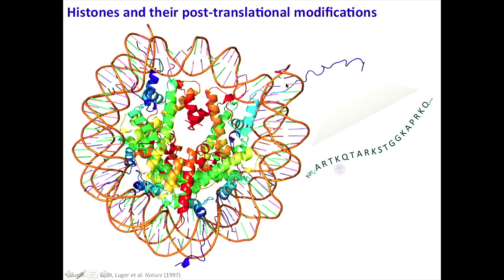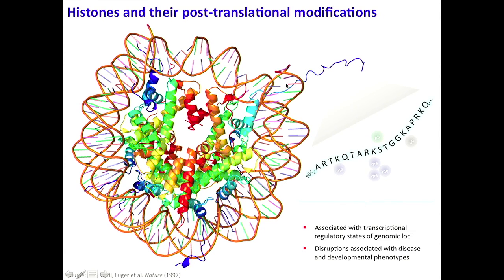And so yesterday we talked about what this assay is reading out and the sort of biology that it's reading out. It turns out that we know that there are associations with epigenetic processes and disease, but there are associations with all kinds of environmental conditions in epigenetics. It's potentially a metabolic sensor. Epigenetics have been proposed to be a readout of cell metabolism and nutrients that are available to cells. So it's really quite a catch-all assay, and lots of different sorts of conditions or treatments that we might do to cells could have an effect in the epigenetic space or in the chromatin space. So that's why it's one of our favorite assays.